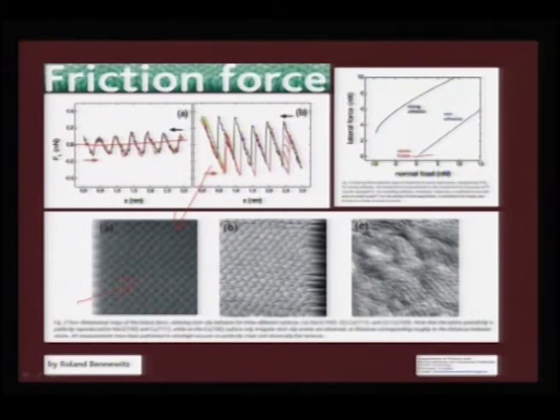And for copper 111, again you see a similar periodicity, but if you go for copper 100, you see an irregular lattice spacing. So, that clearly represents what sort of atomic arrangement that you can sense.